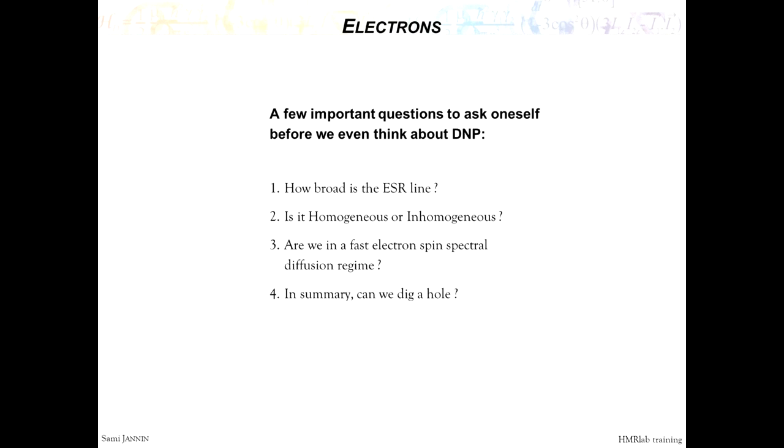In the past, we used to make all our samples with little beads of 10 microliter because we thought that the polarization was better. And one day we became so lazy that we started to do ice blocks. But we never really quantified how much worse it is, and maybe this is something. I think it's been 10 years. We keep saying, one day we should do this experiment and compare, but we don't do it because it's so boring to do all these beads. But probably we might get better performance with beads than with blocks because of the heating problem. Maybe let's do that next week.